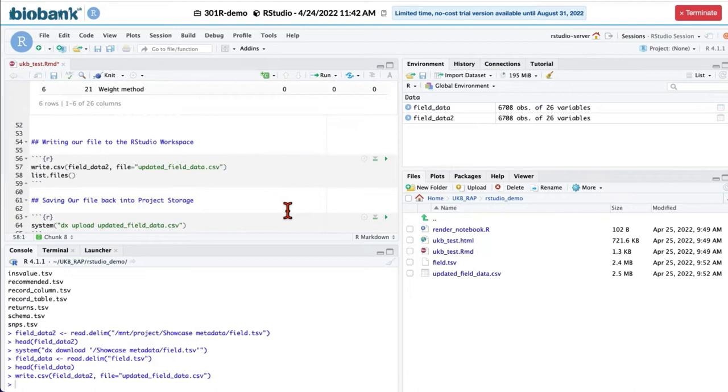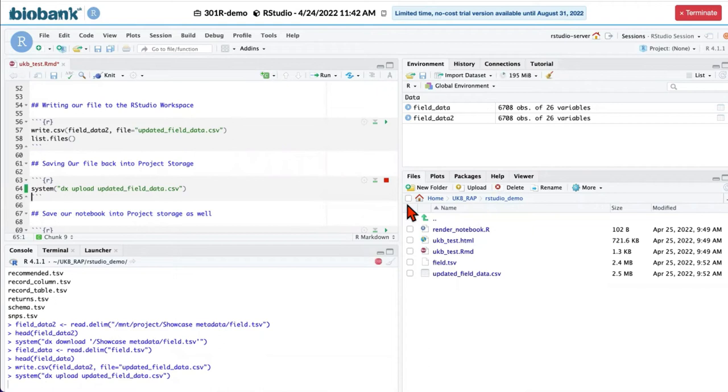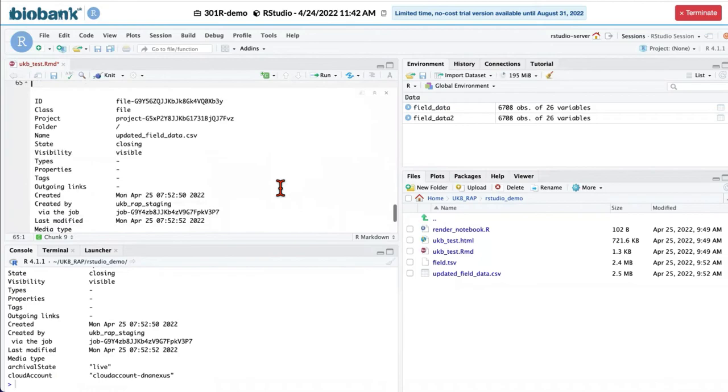For that, we will be using DX upload. And as I said before, we are using system function to wrap our command line code in R. Now our file is uploaded into the project storage.